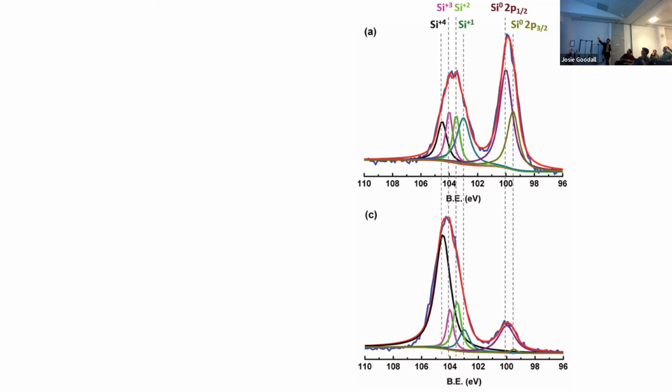But those different... I don't know whether silicon halides would come. Has anyone done silicon halides? I think what would be significantly different to the oxide? Maybe silicon carbide. What do you think? What would you use, a single environment, a single peak? I probably don't know. Yeah, I probably always put the two components on there. I think that is probably the best.